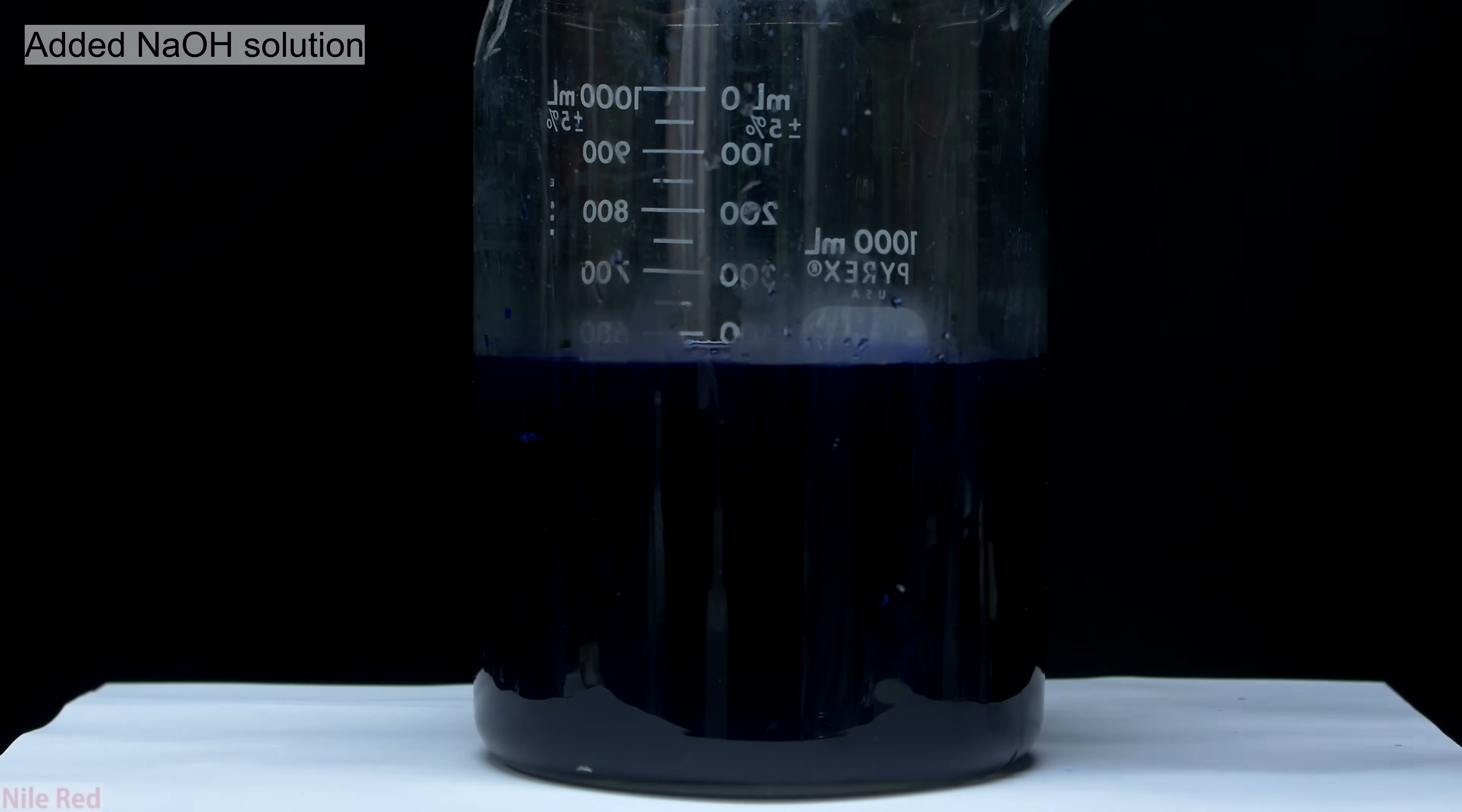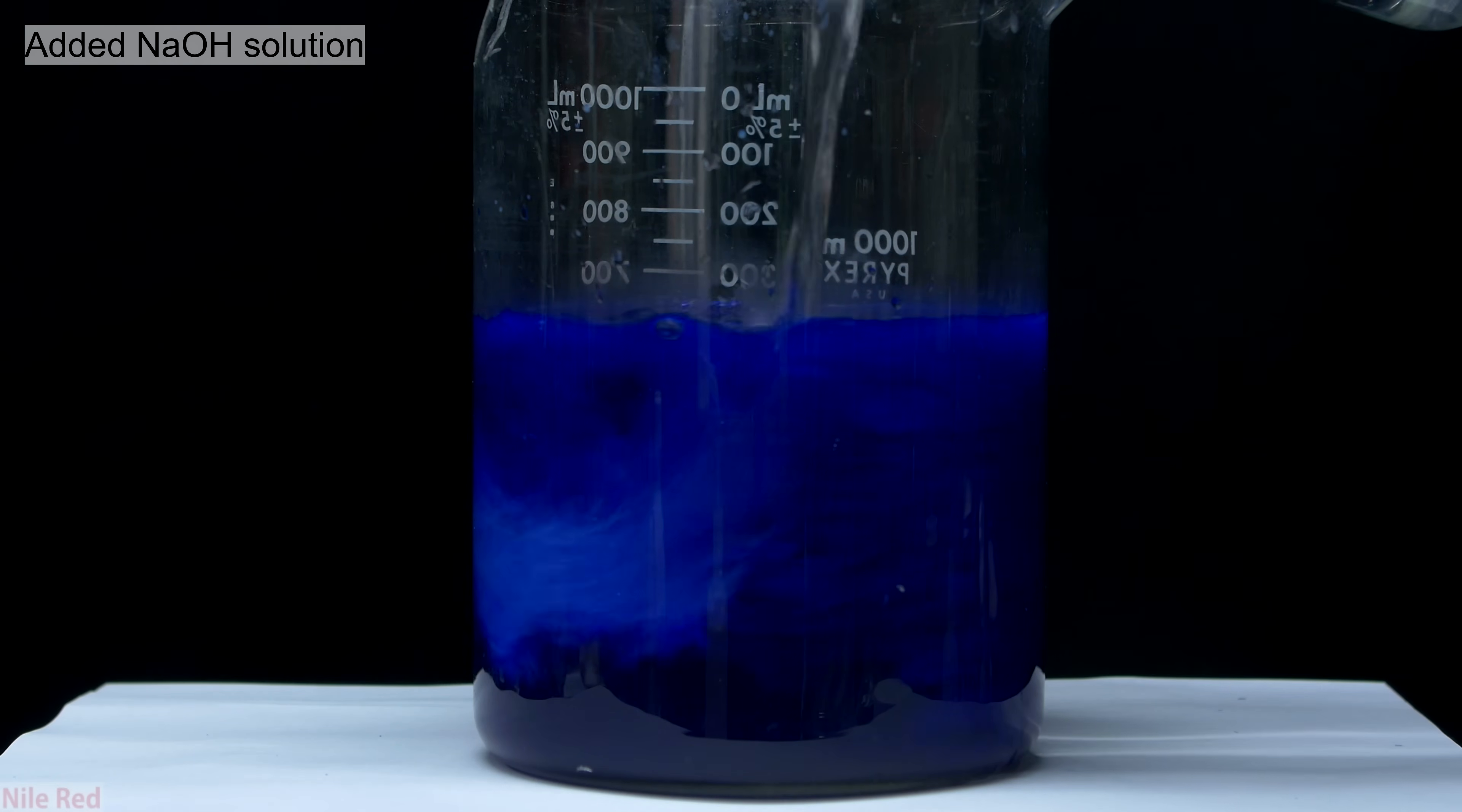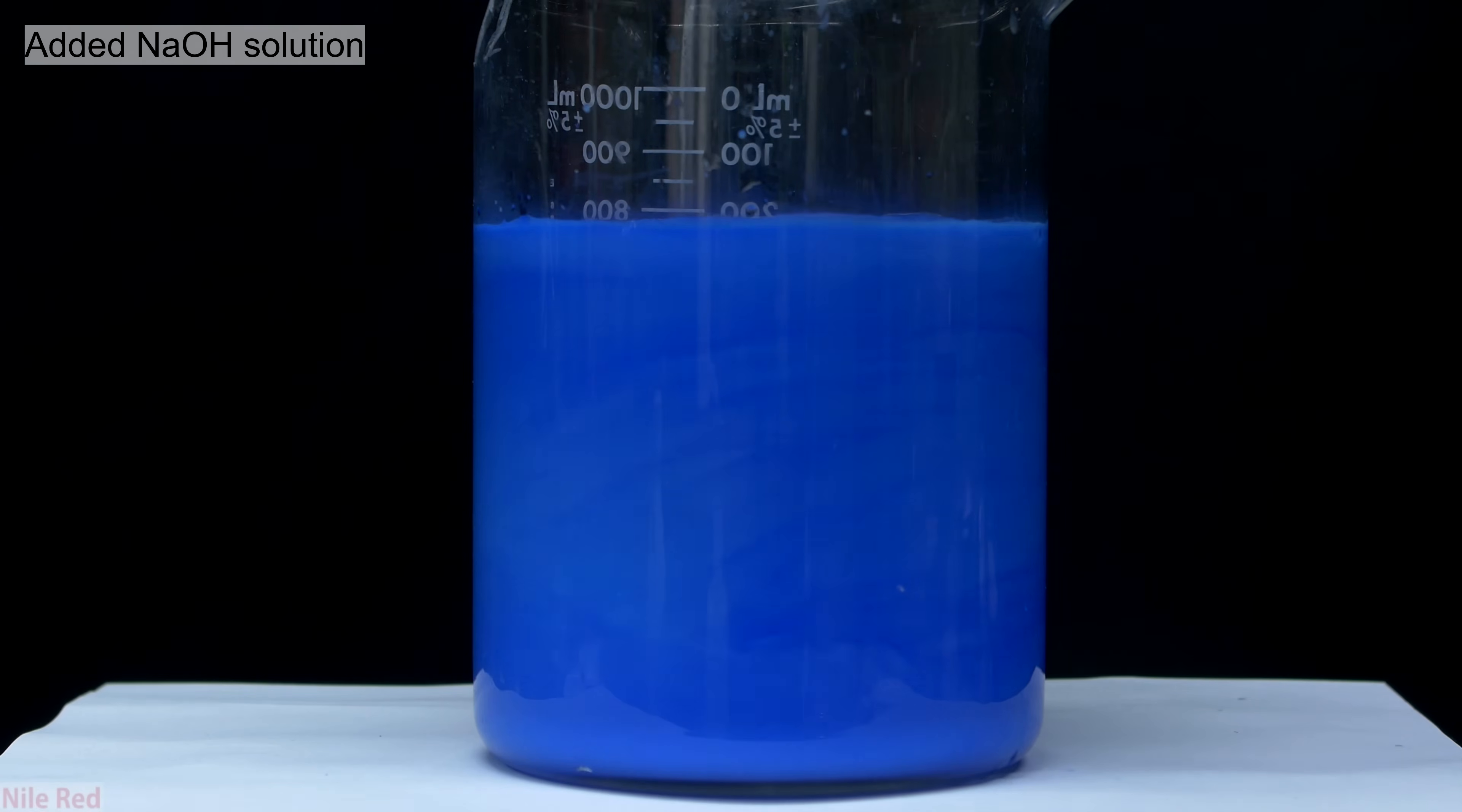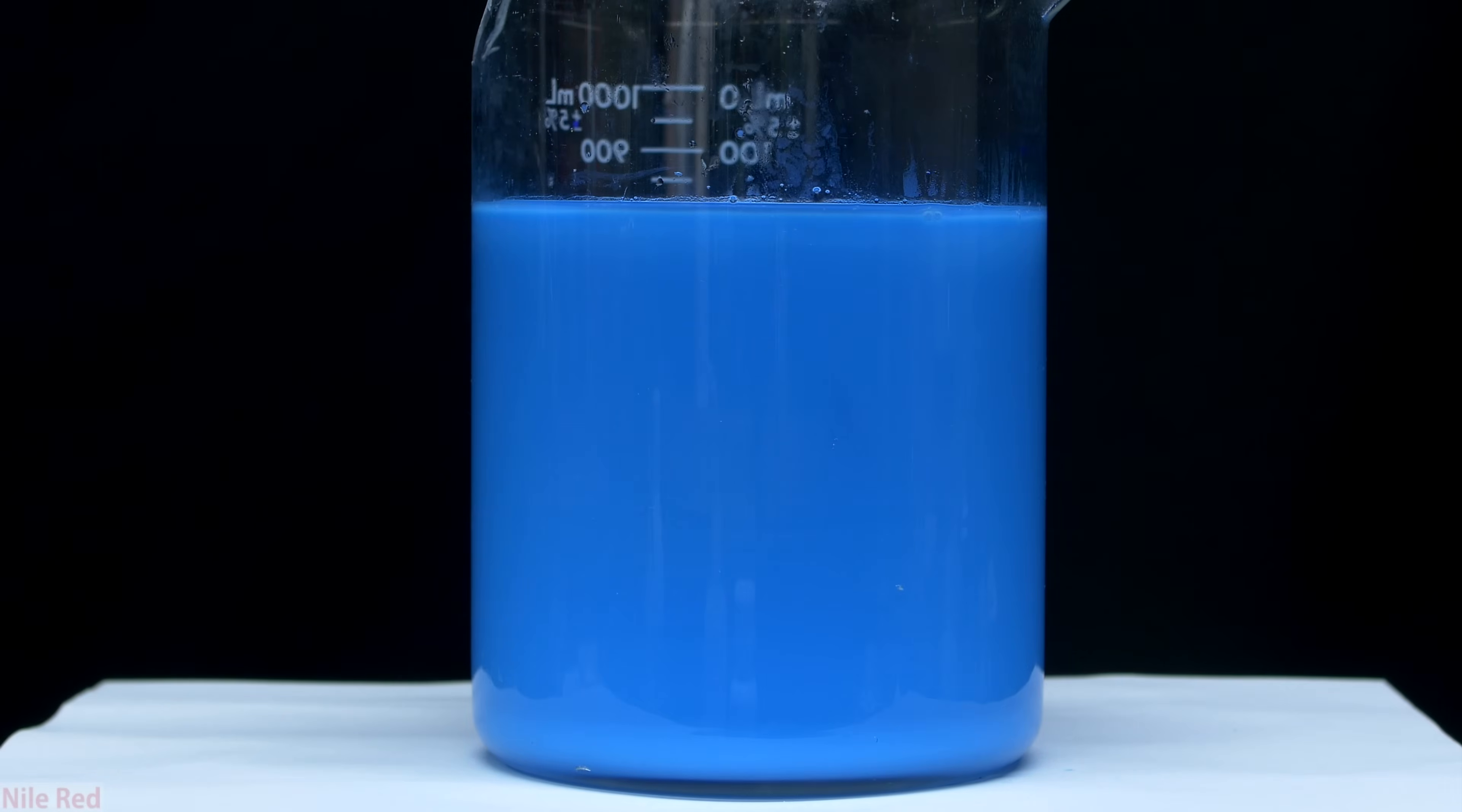The sodium hydroxide is then dumped all at once into our dark blue ammonia copper hydroxide solution. Immediately when the sodium hydroxide solution is added, copper hydroxide starts to precipitate out. After all of the sodium hydroxide is added, we're left with a lot of very nice light blue copper hydroxide. The sodium hydroxide breaks apart the complex that formed between ammonia and copper hydroxide, and it serves to fully precipitate all of our copper hydroxide from solution.